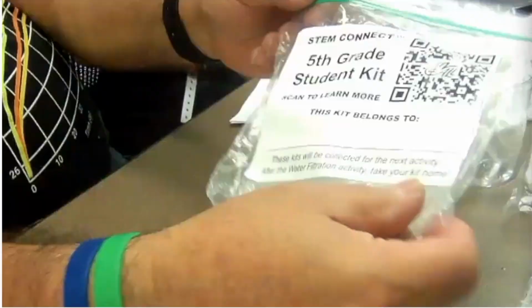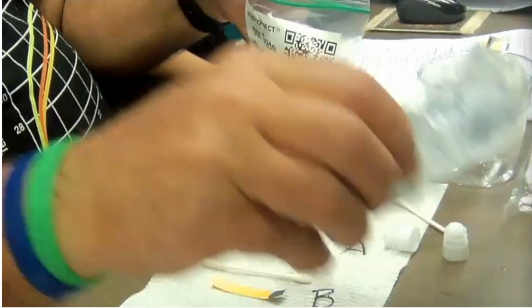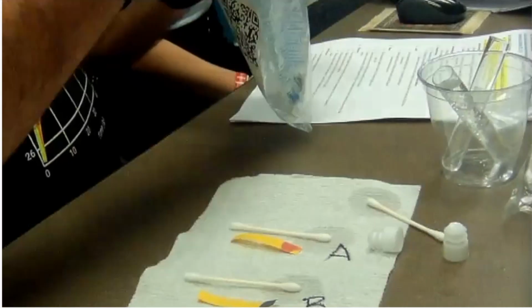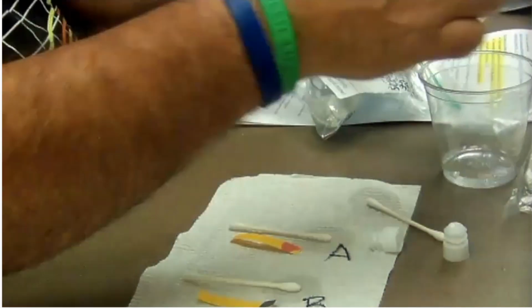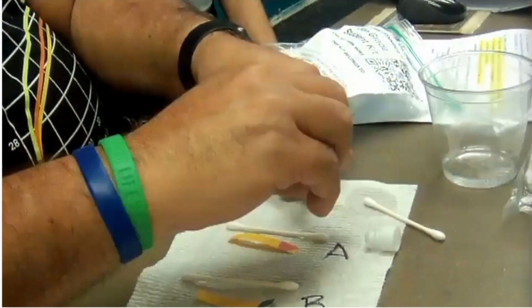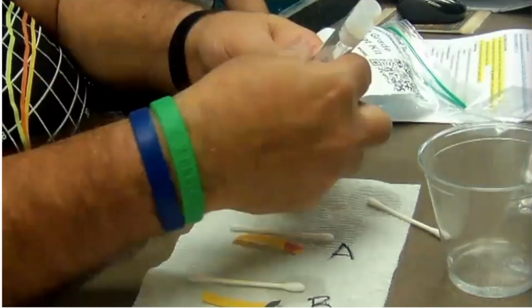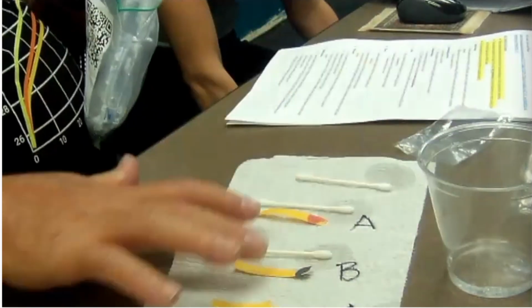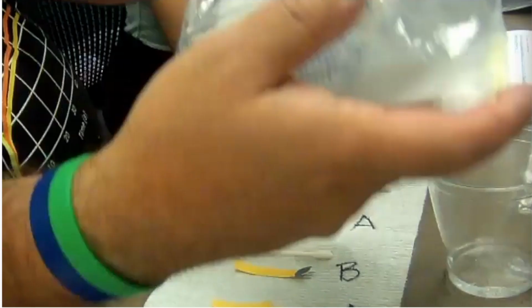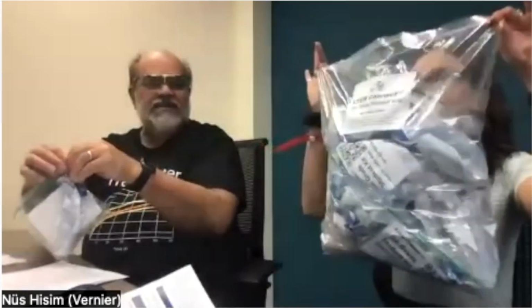Finally, before we finish, I want to remind you: student's name on the baggie. Their goggles, every student gets a pair of goggles, goes in the baggie. As far as the test tubes go, dump them out. Put the caps back on. You might need to have a cup or something handy so you can walk around the room. All of this material is used, so this is just waste at this point. But the goggles and the test tubes need to go back in the baggie, and these need to be retained for activity 2.